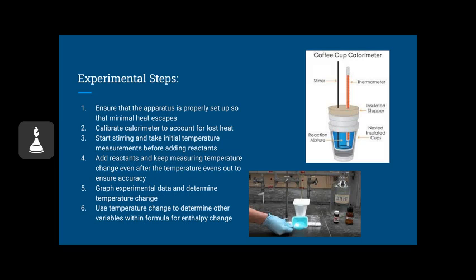So let's ensure that the apparatus is properly set up before we actually do the experiment so that minimal heat escapes. Then we have to calibrate the calorimeter to account for the lost heat that inevitably has to escape. Then we use that constant that we find after calibration, and we factor that into our final equations. Then we're going to start stirring the mixture, but not include the reactants yet. We have to take our initial temperature without adding the reactants. Then when we add the reactants, we have to keep measuring the temperature.